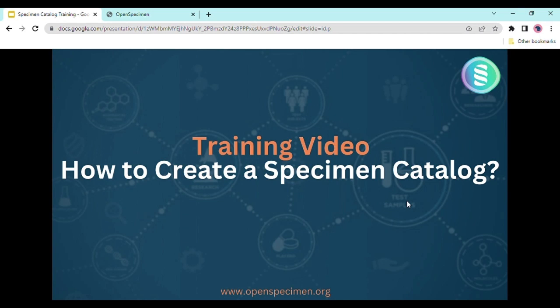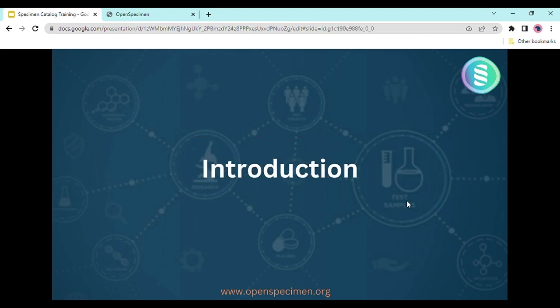Hello everyone. In this training video, we'll see how to create a specimen catalog. A specimen catalog allows researchers or the public to request certain samples by adding different filters according to their research. Open Specimen supports creating multiple catalogs.